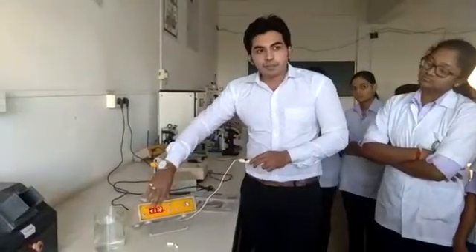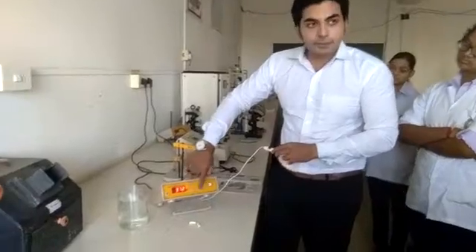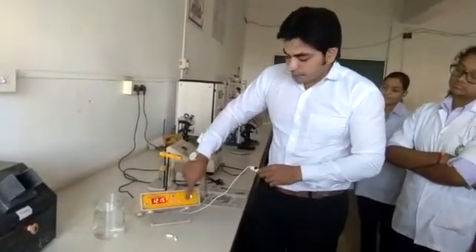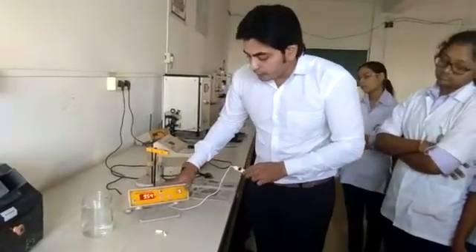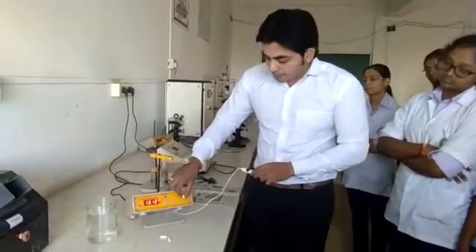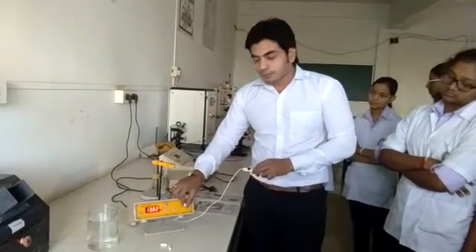This is the display mode of this instrument, and these two are calibration knobs. You have to calibrate the instrument. Then this is the temperature adjustment knob. You have to select the proper temperature of the instrument so that the temperature is maintained constant throughout. You have to select 24 degrees Celsius, which is the room temperature.